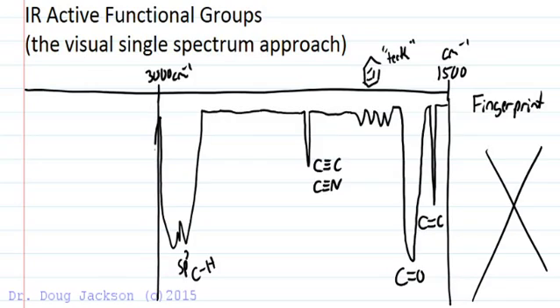Then immediately to the left of 3000, sometimes even blurring onto the 3000 line, we might see SP2 CH stretches. And then a little further over we might even see SP CH stretches. Whenever you see an SP2 CH, look to verify that there's a C=C double bond. Likewise, when there's an SP CH, look and see if you've got a triple bond because that can tell us whether or not we're interpreting the spectrum correctly.